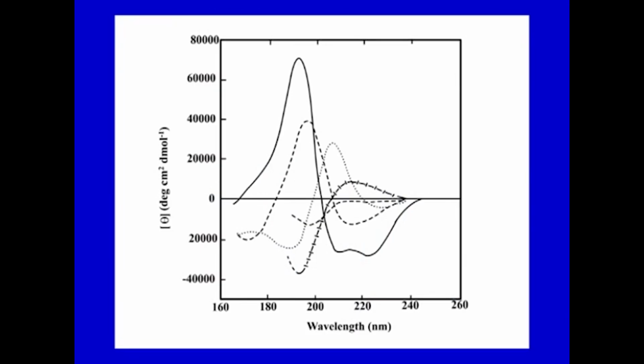So, these are different patterns. If you have a protein molecule and you are observing it in CD spectroscopy, then there are clearly signature patterns available. For alpha helix there are very clear negative peaks at 208 or 209 and 222 nanometers.